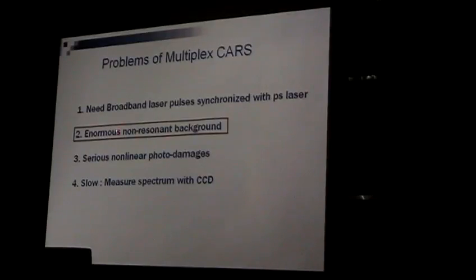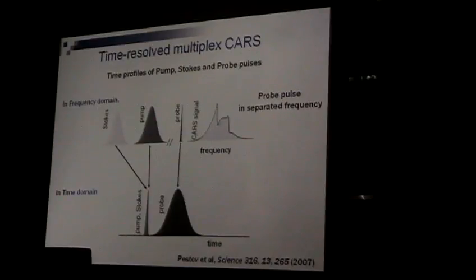And again, we have the same problem we discussed yesterday: because you have a femtosecond laser, photodamage is horrible. In addition to that, now you have to take a spectrum, so inherently this is much slower than a PMT detector. So let's add two more problems to work on.